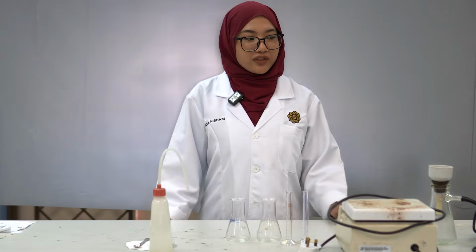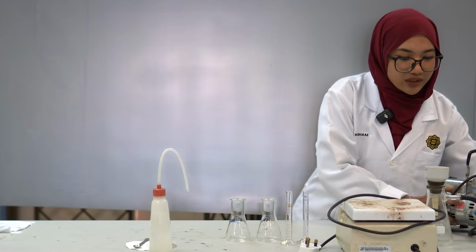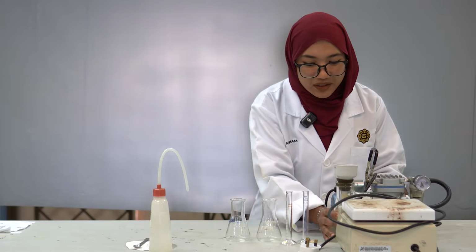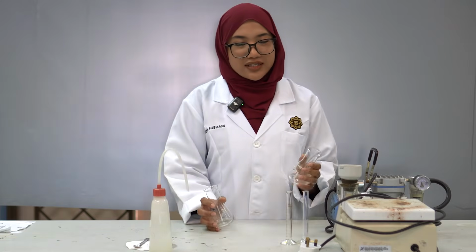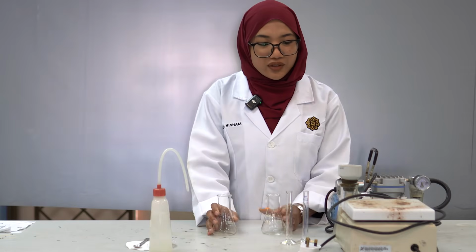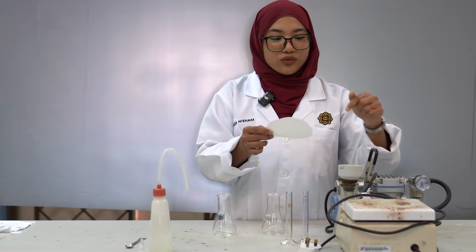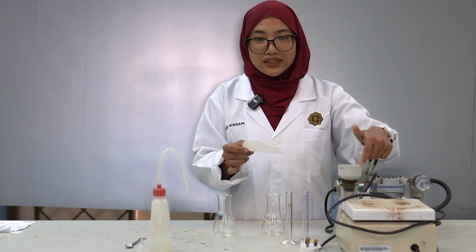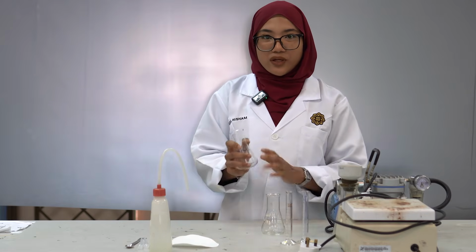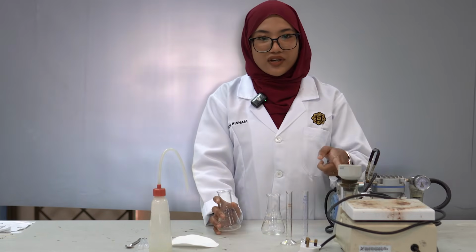Alright, so I'm going to talk about the vacuum filter. So this is the vacuum filter. As we know, there is a mixture solvent and the single solvent here. First of all, we're going to cut this filter paper to fit into the filter funnel. So we put it here, and then we do it one by one. First we're going to put the single solvent into this, and we're going to observe it.